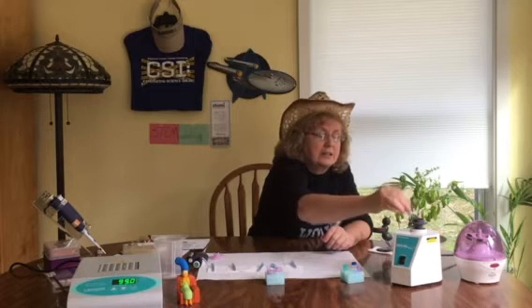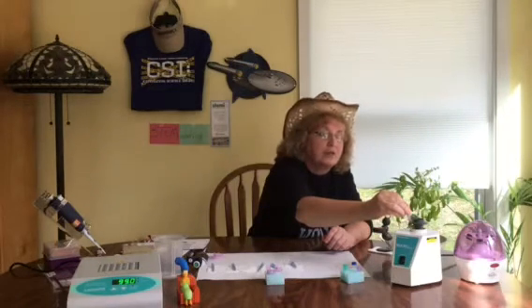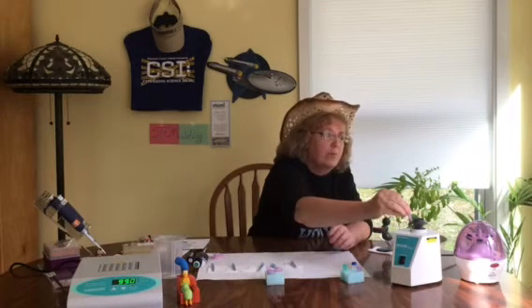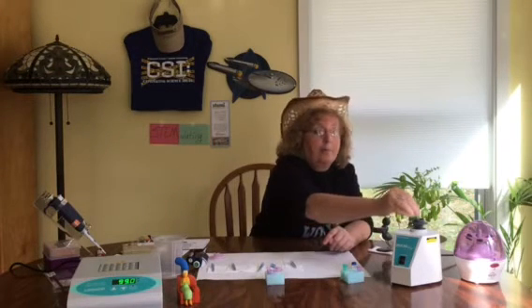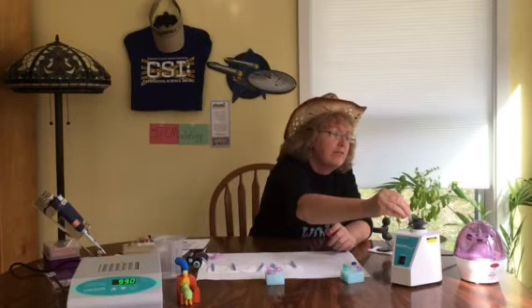Remember, your insect is like Dorothy. You want to send Dorothy to the land of Oz. You should see a miniature tornado inside your tube. Depending on what type of vortexer you have, you can have more than one student doing this, but it should be about 30 seconds. Probably even a good time to meet some of the other students that are at the rodeo. Yes, I think Dorothy and Toto have definitely headed to the land of Oz.